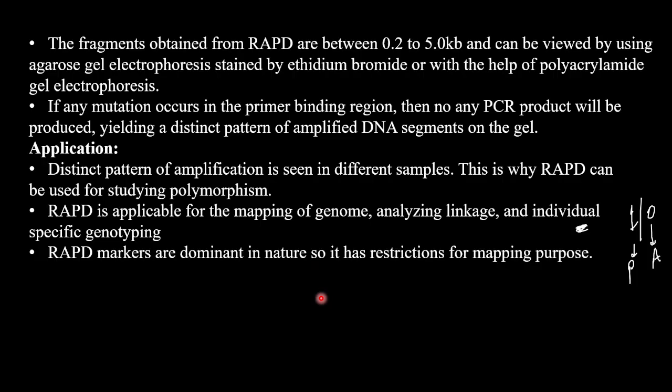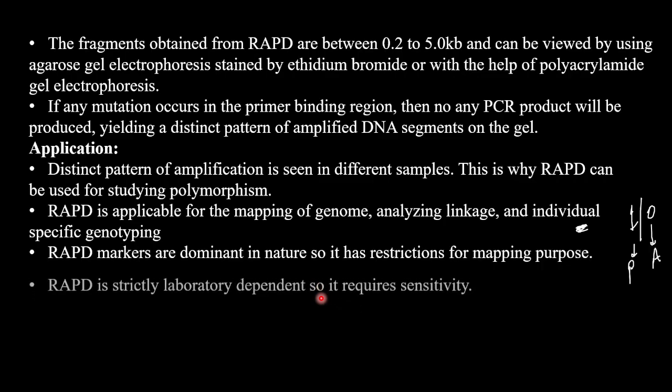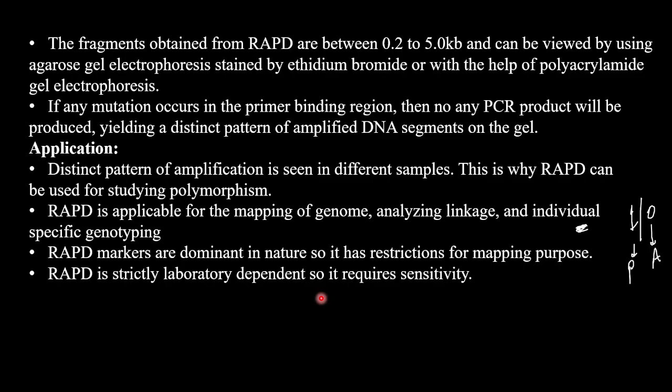These are dominant in nature because you cannot differentiate between capital A, capital A and capital A, small a. You cannot differentiate homozygotes and heterozygotes, and this is the reason this technique is dominant in nature. It is strictly laboratory dependent, so it requires sensitivity.